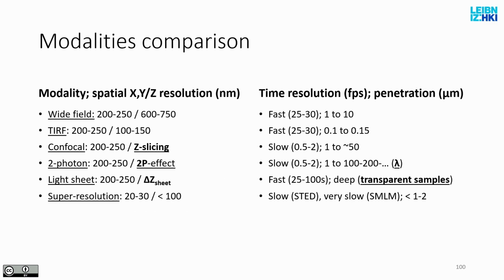The main goal, of course, is to get images at high resolution, get images fast, get images from large tissue or entire organs, and how do we choose our microscopy modality according to what we want to achieve.